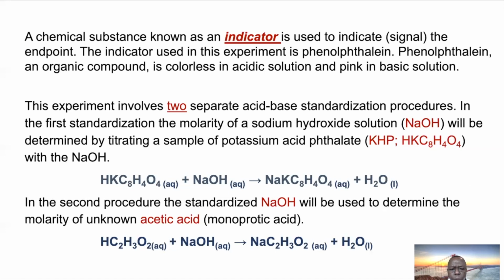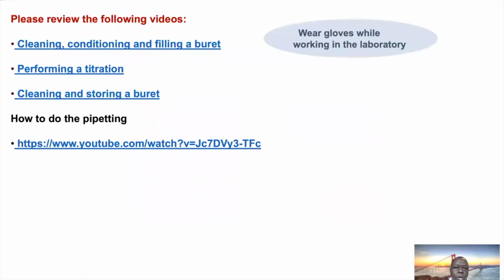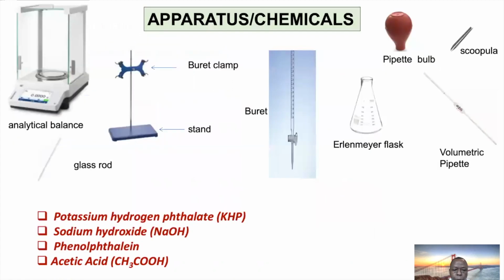And of course, the other acid is the vinegar. So this is an acid, this is an acid, and this is the titrant, which goes in the buret. You know the buret? It's the long glass apparatus used in titration. I don't want to go through the titration curves. You will cover this in Chem 2. Any questions before we dive into the data sheet?